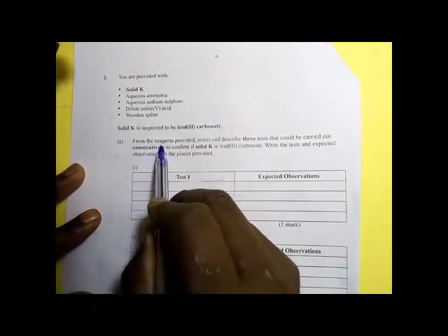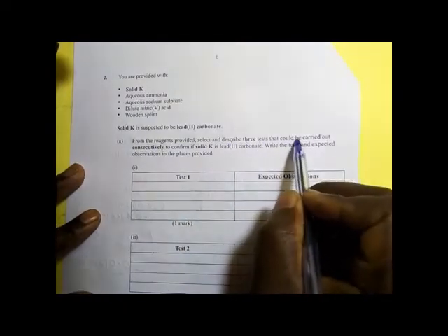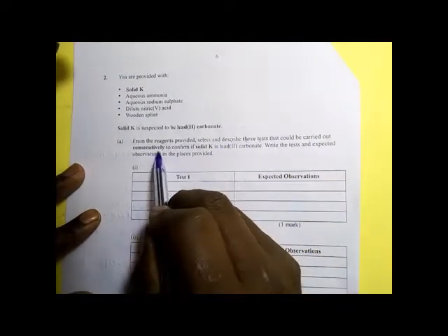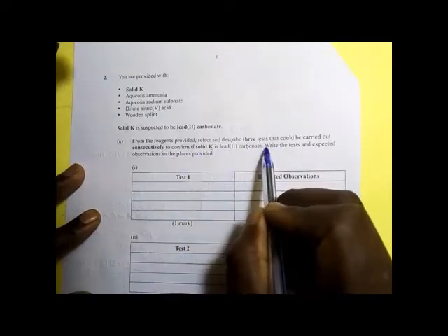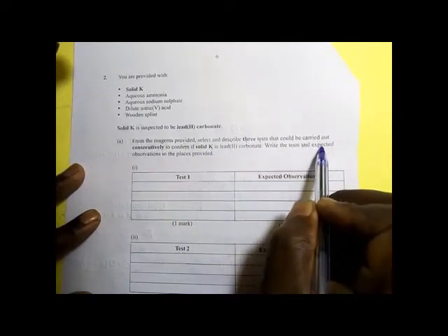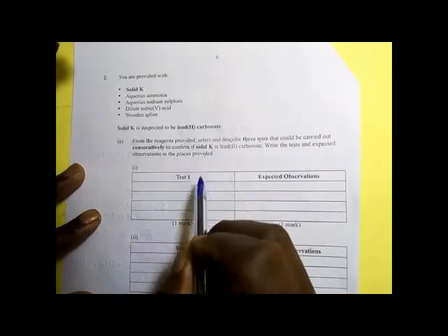So from the reagents provided, select and describe 3 tests that could be carried out consecutively to confirm if solid K is lead(II) carbonate. Write the tests and expected observations in the places provided.